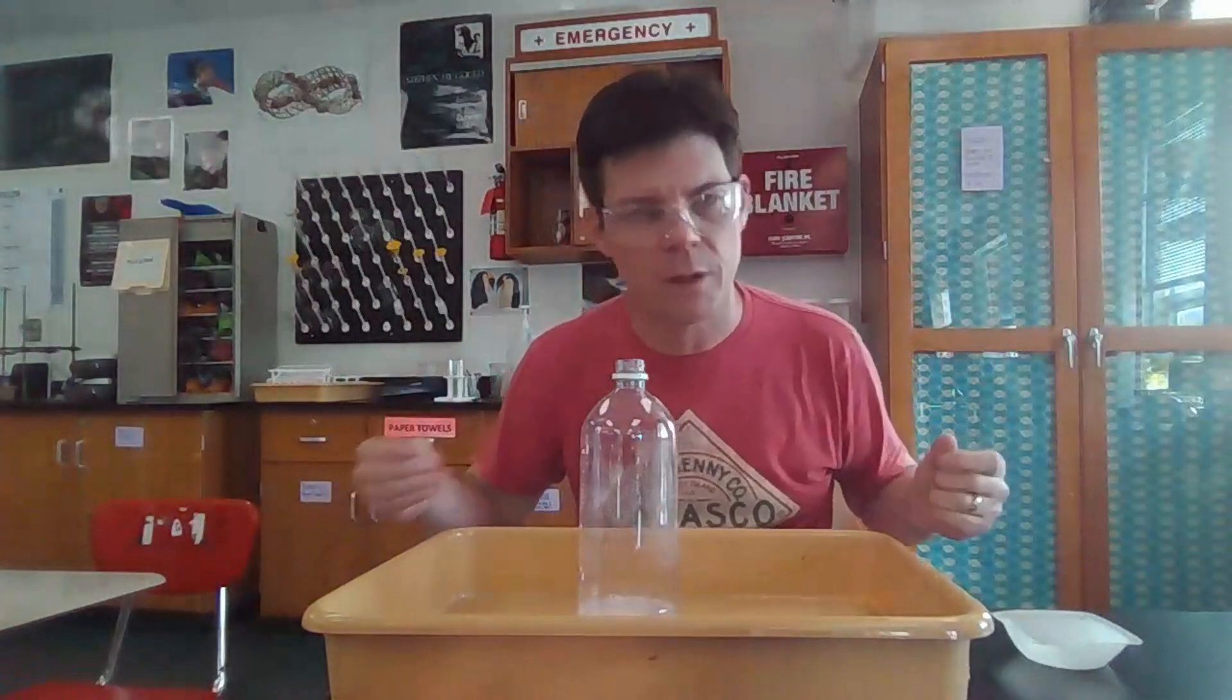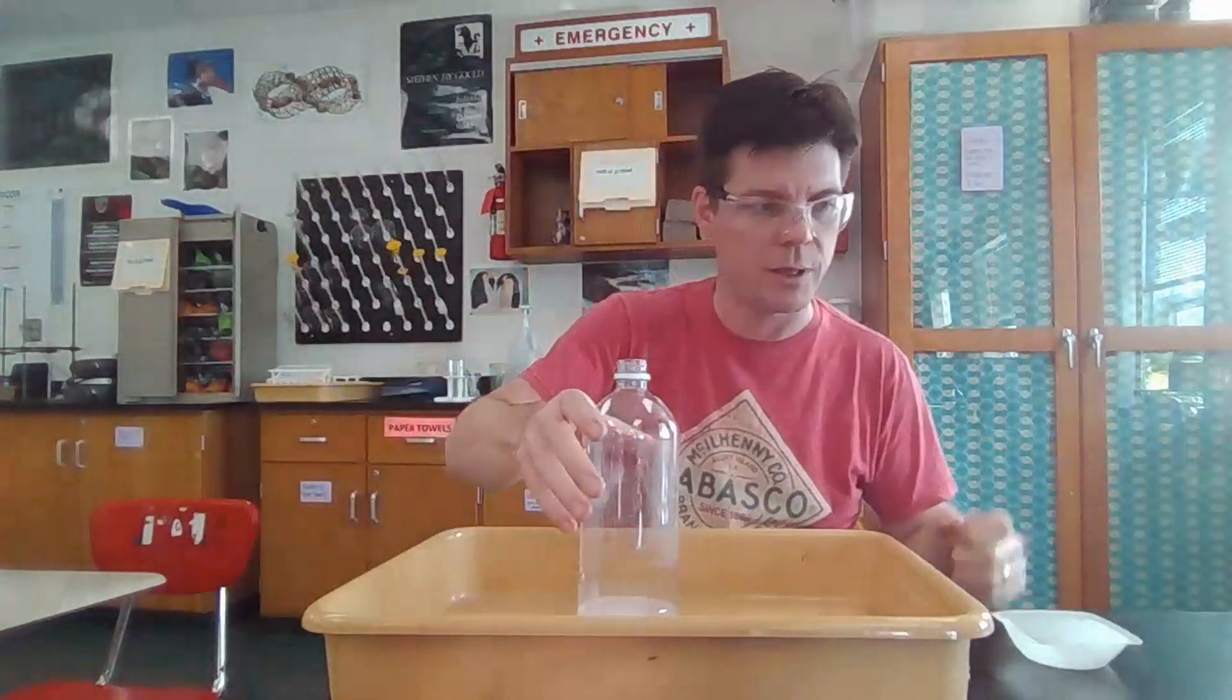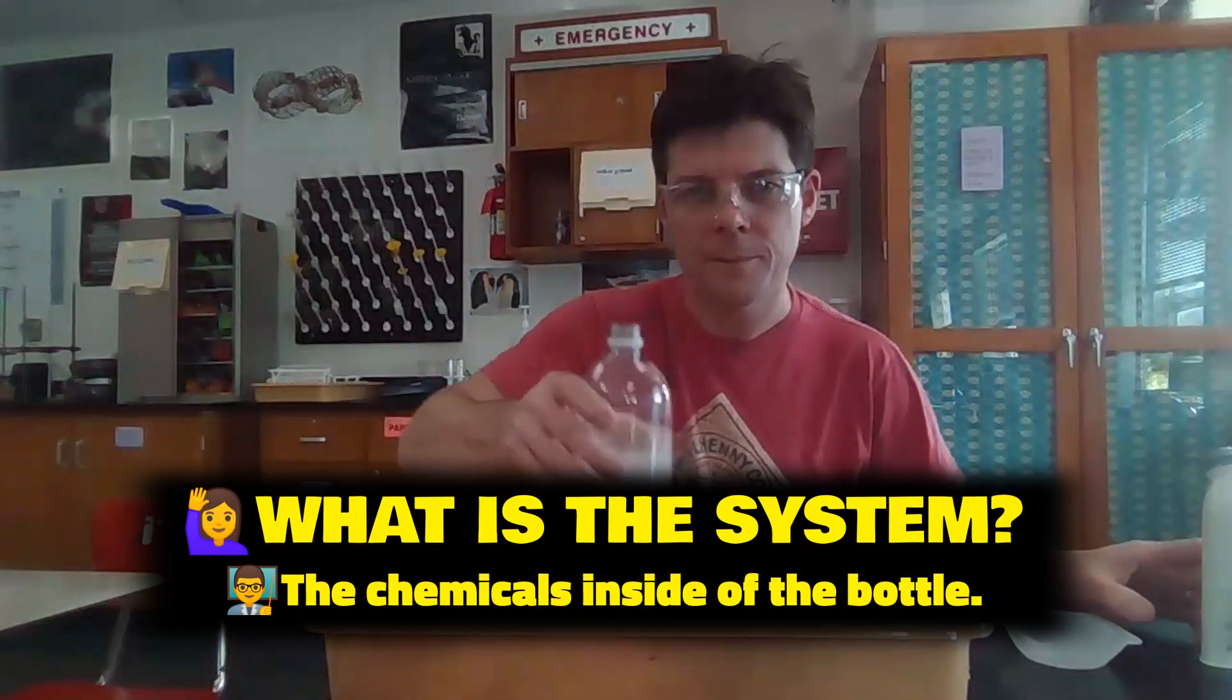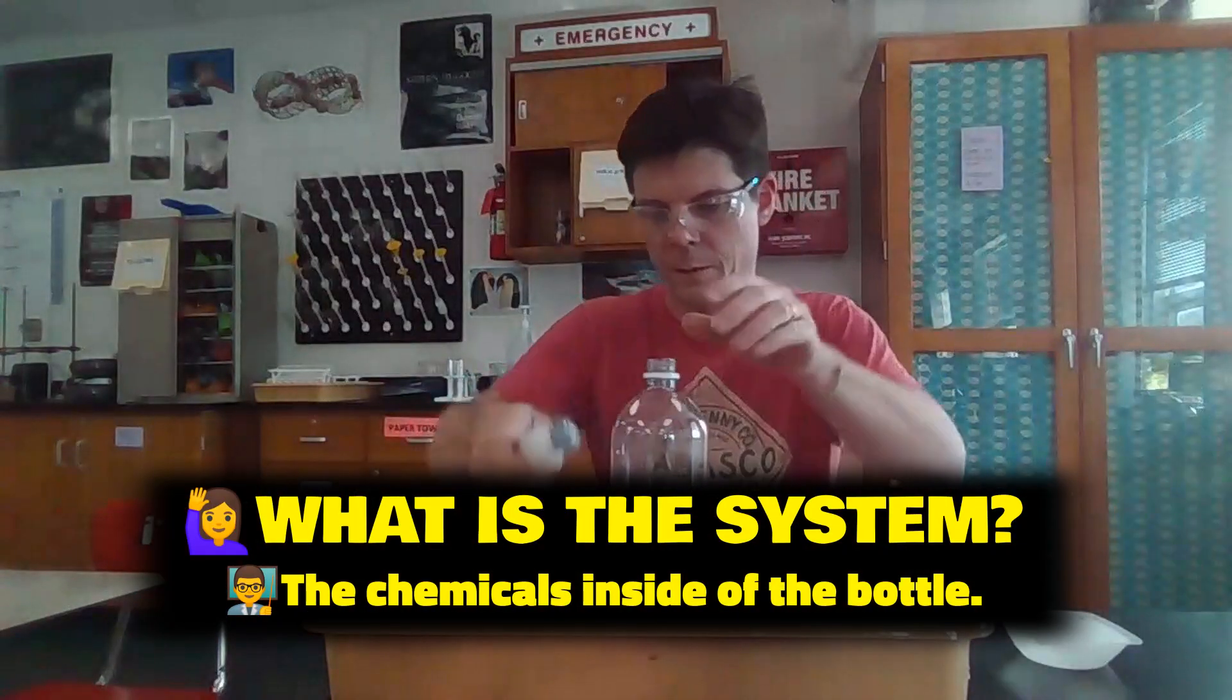Now what I'm going to do is I'm going to swirl the bottle to get a rapid production of carbon dioxide, and then I'm going to read the temperature again. I'm swirling. I'm going to read the temperature.